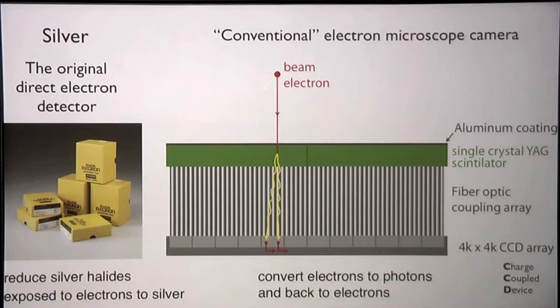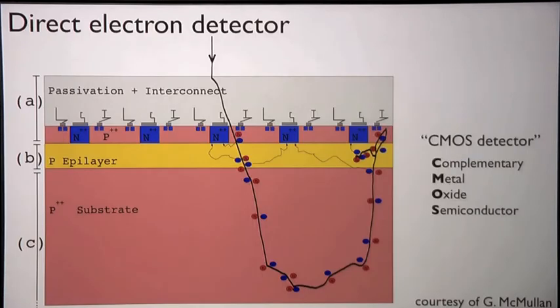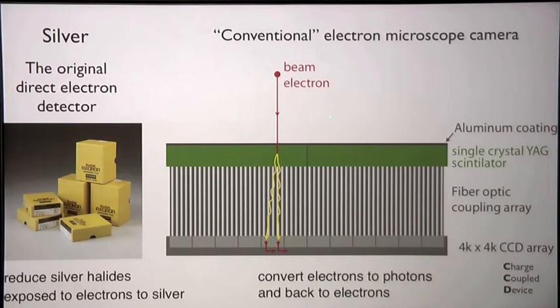So I think most of you have heard about the fact that there are now these interesting things called direct electron detectors, which are digital, that have largely been developed in this lab along with some other collaborators elsewhere. But Greg and Wazi and Richard have spent many years advocating for the fact that you really need every one of those electrons in biology because you're killing your sample with every one of them. So the better we can collect these, the better we can do structures.